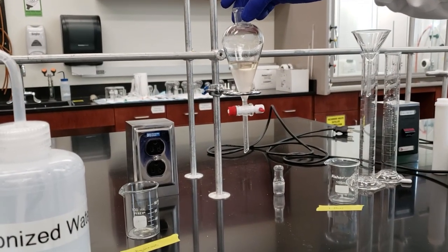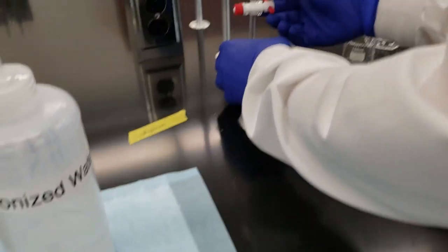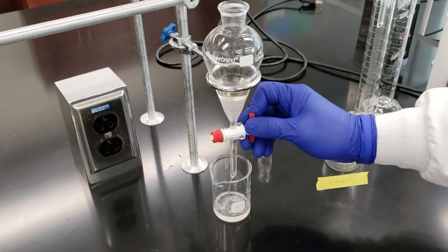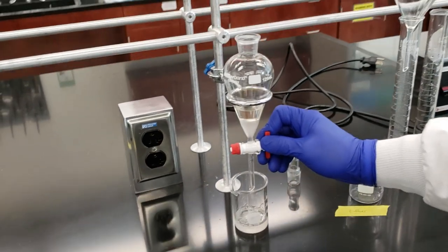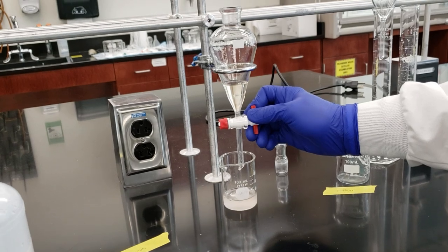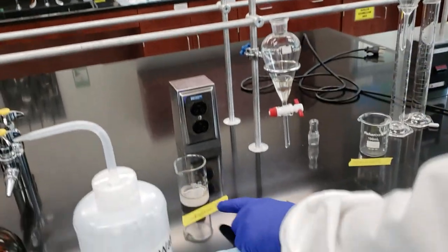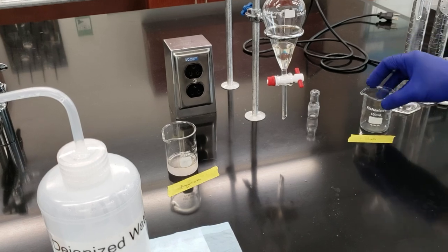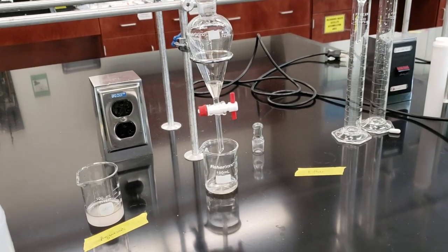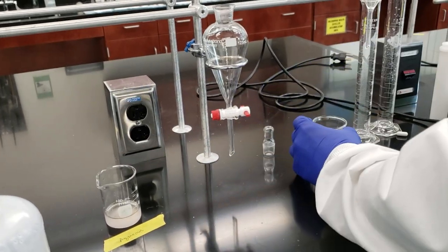So our layers have resolved. We've got our diethyl ether layer and then we have our aqueous layer. So let's go ahead and separate these two out. I'm going to drain off my lower layer, remembering that our original reaction mixture was aqueous based. So that's my lower layer, and that's identified as our aqueous layer. I've marked my tape here so I don't mix up any of my layers. I'm going to take my ether layer, drain that out into a separate clean flask, and set that aside. And I've marked that as ether.